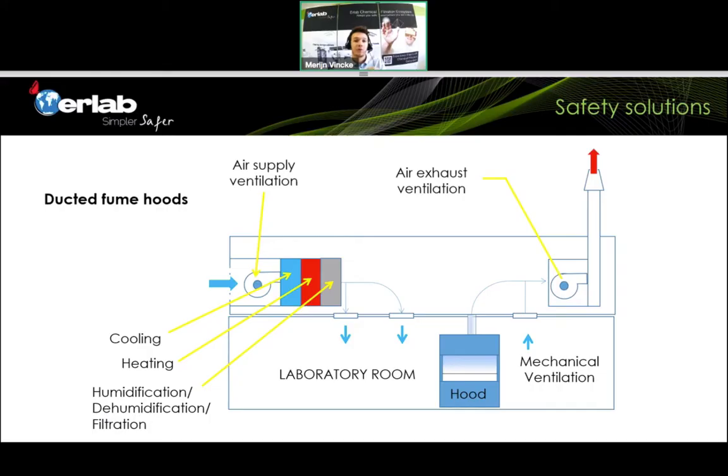In two of the safety equipment that are used the most frequently in labs, then we can tell you a bit more about those. So let's start with the ducted fume hood. The ducted fume hood is a fume hood in which you will work with chemicals and the air will be extracted to the outside. So all the chemical hazards that are coming free in the lab will be exhausted by a ventilation to the outside air.